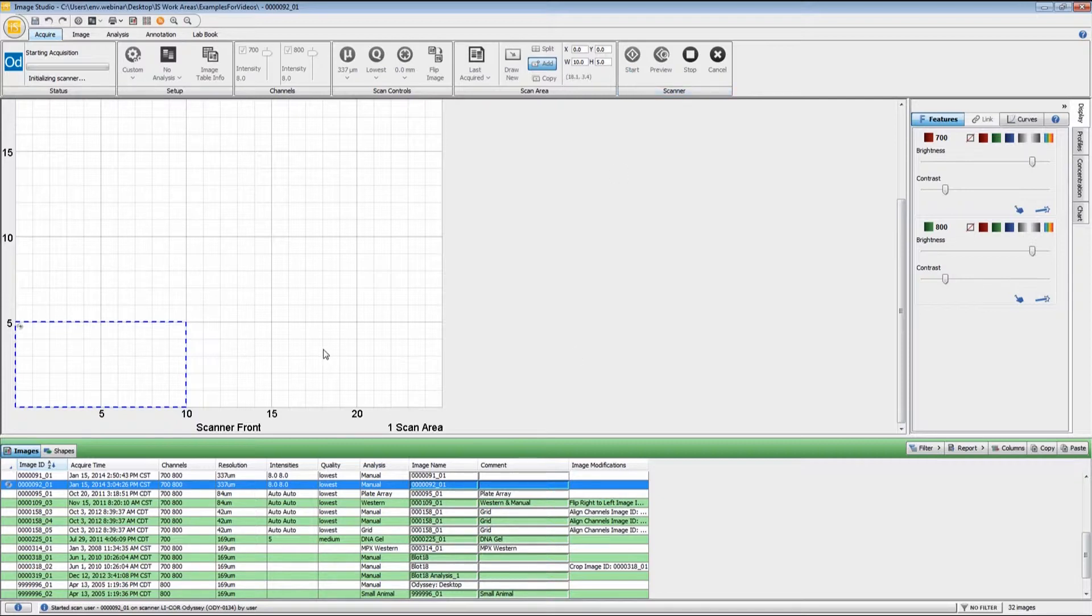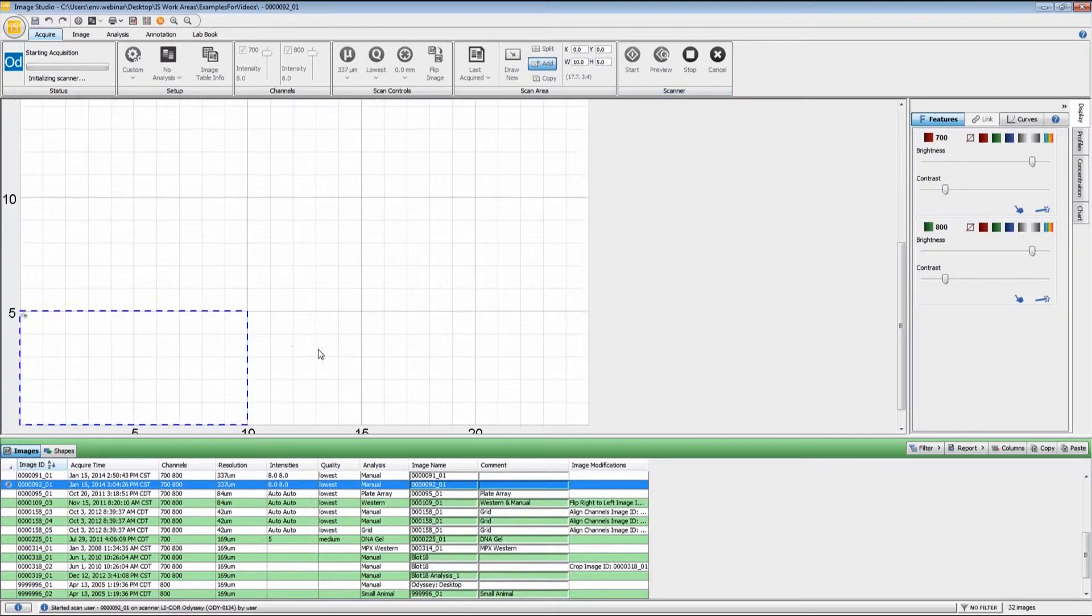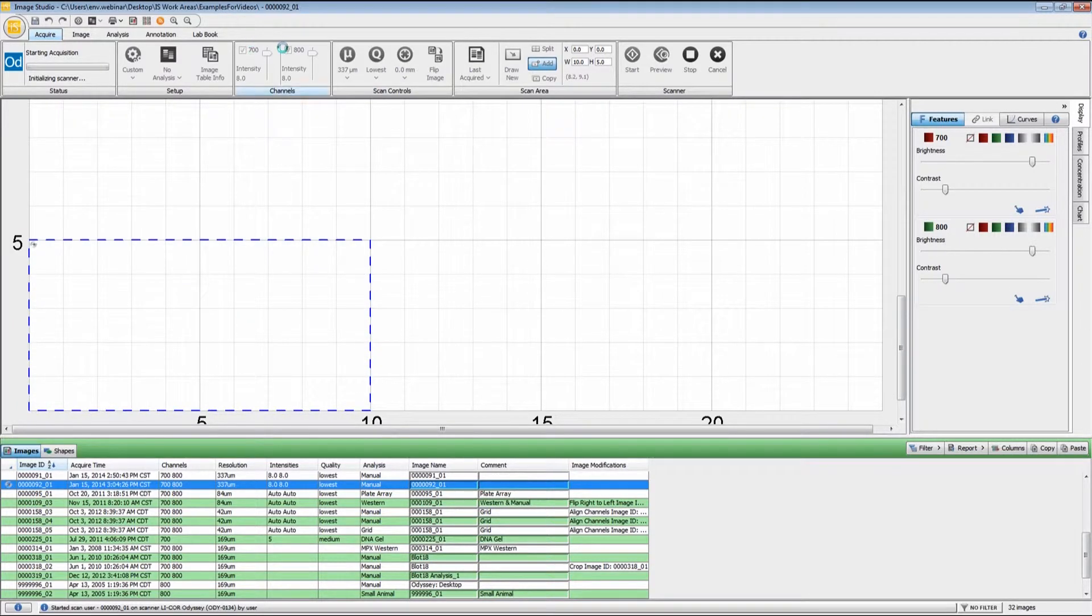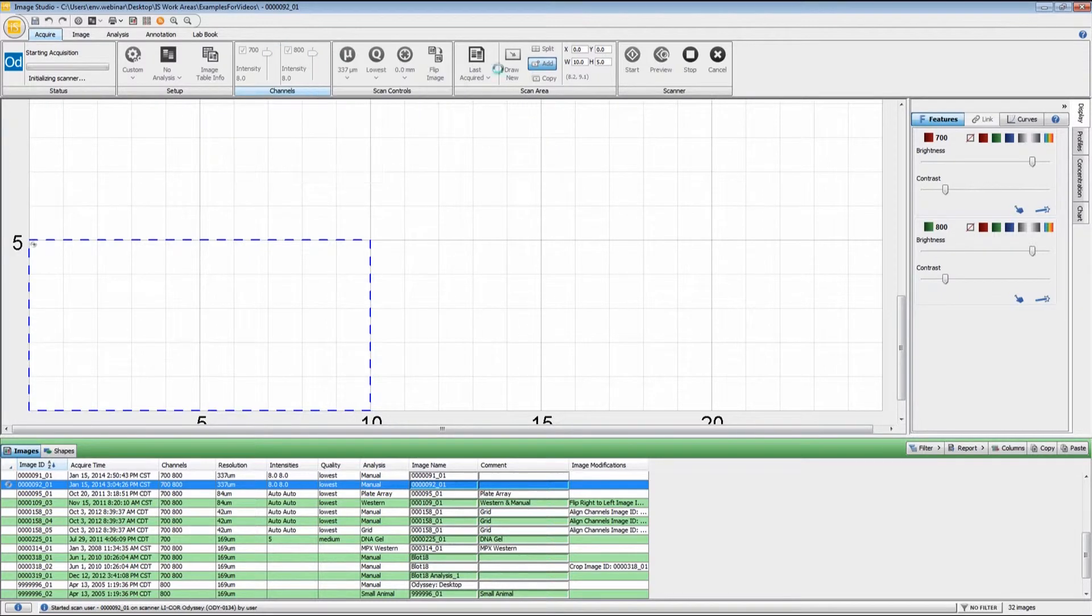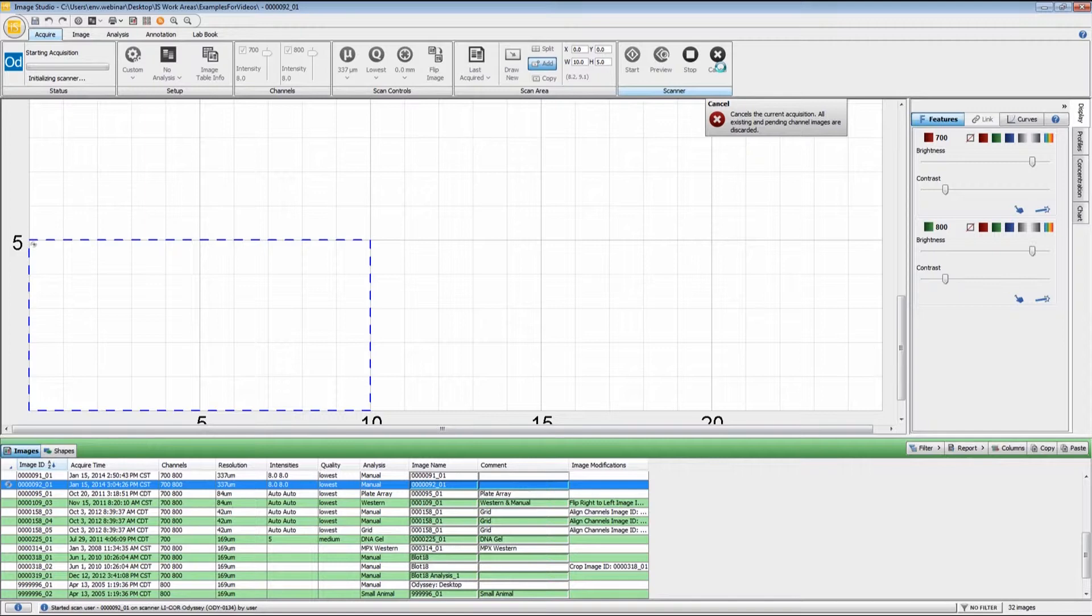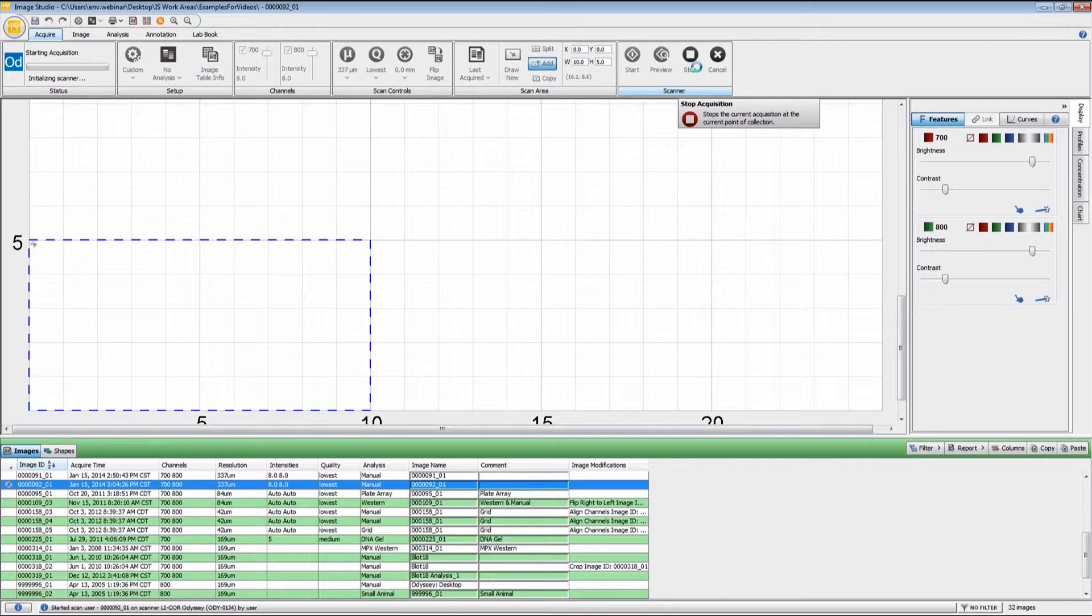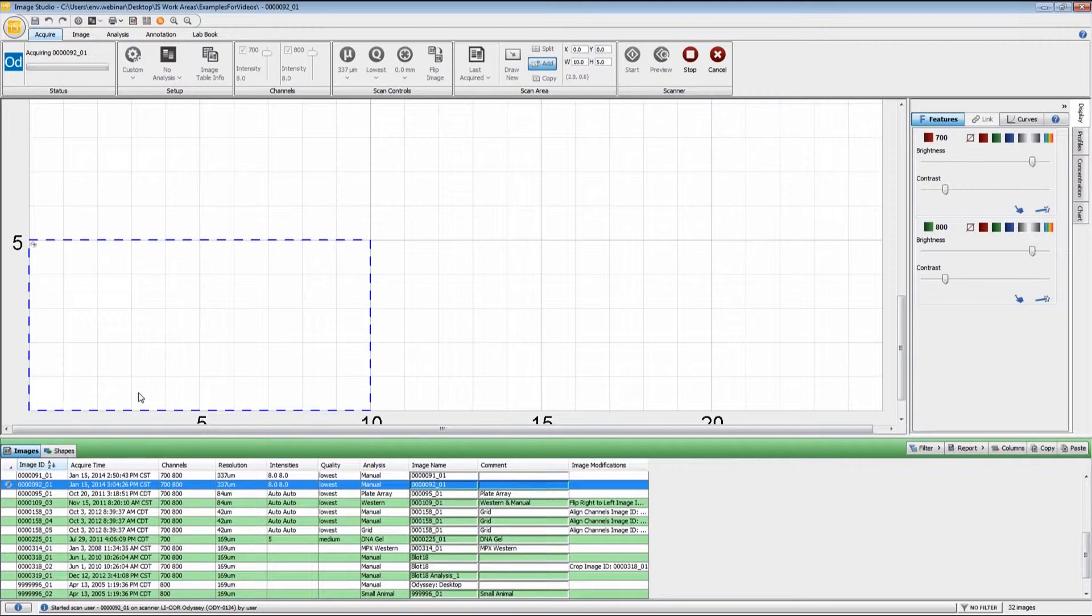The image will appear while it's scanning. If you see something is very wrong with the settings, as we'll see here with this high scan intensity, you can click cancel and that will delete the scan. If you're watching it as it's going along and you see that you've scanned far enough, you can click stop and it will just stop it at that point and save the image. Once the scan is initialized and it starts downloading the image, it will appear here in the scan area.